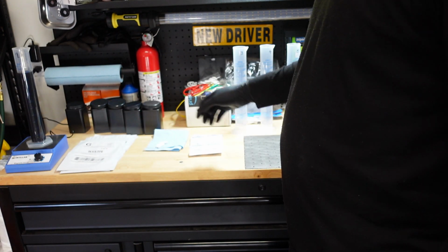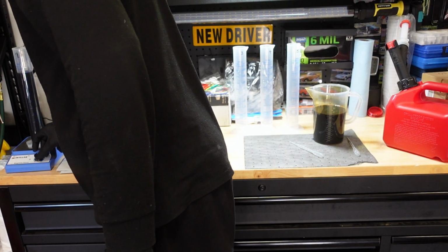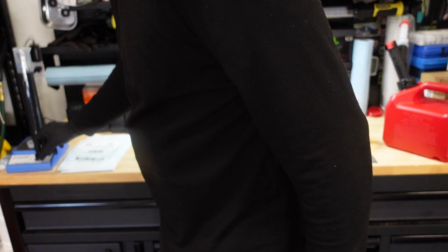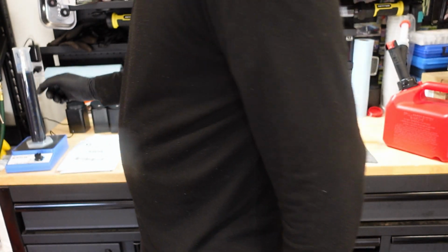So what I'm gonna do is let this go, and make sure everything is spinning here. I want to make sure I see a little vortex in there.